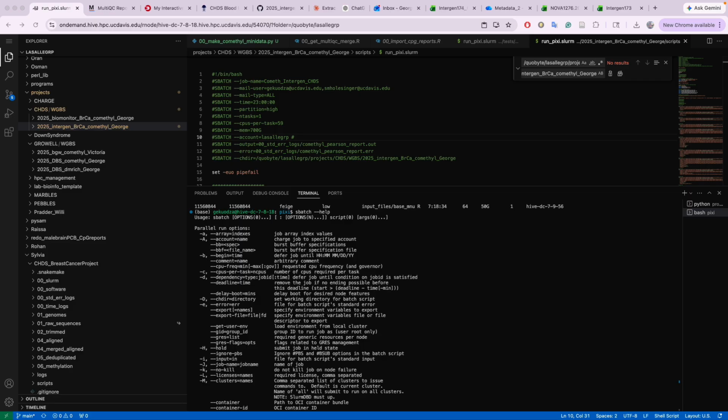Can you try logging in on the terminal? On the terminal, it's sort of like this. All right, see when it starts. Basically, you just need to write this. Sometimes it's the Genome Center group, or you can do the public group.